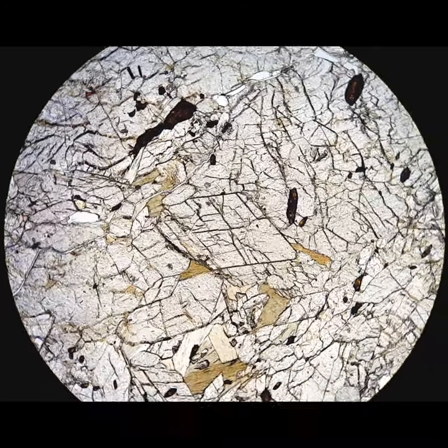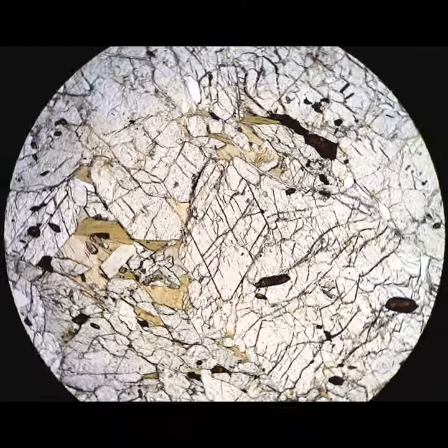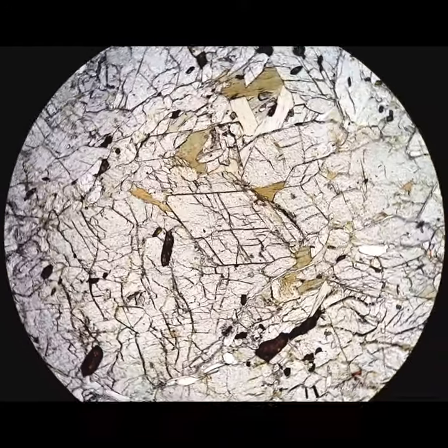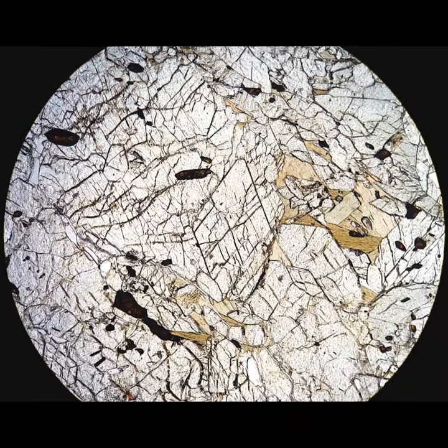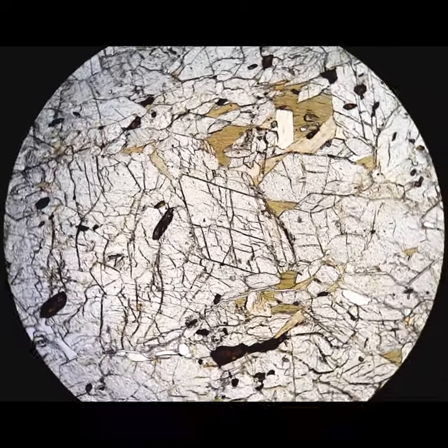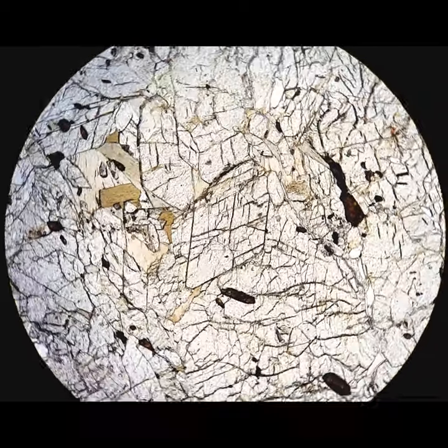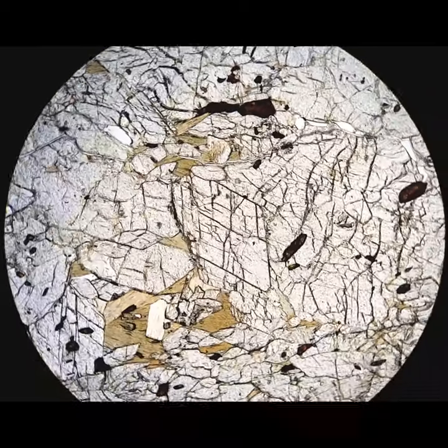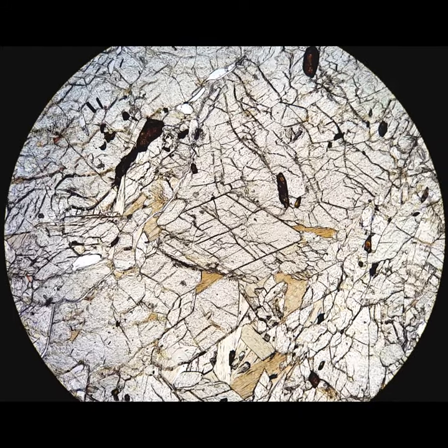This is an amphibole, gedrite, and it has characteristic 60-120 cleavage. So if you look at that central grain, not just the outermost edges, but also the internal lines are parallel to each other and intersect at an angle of 120 and 60 degrees.